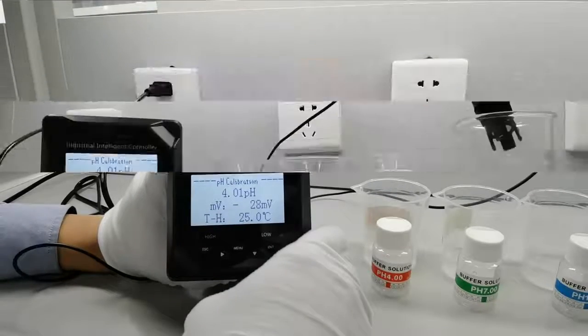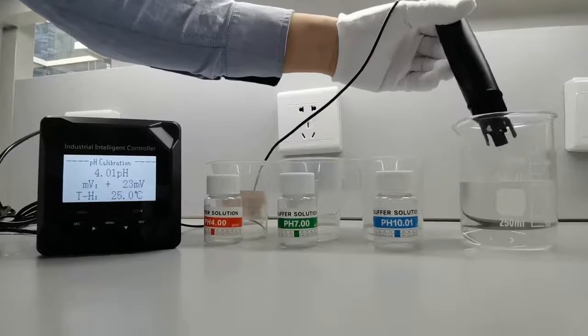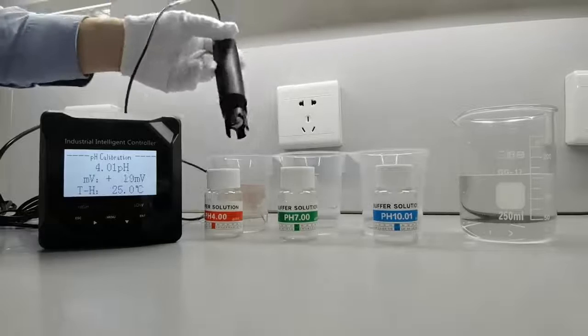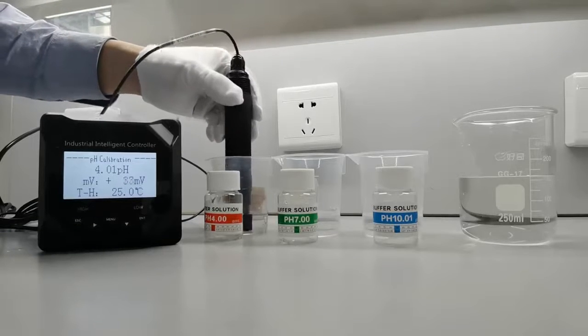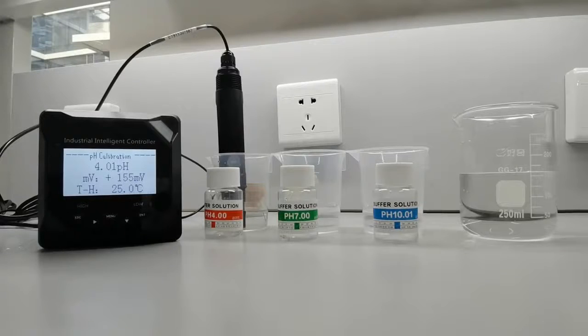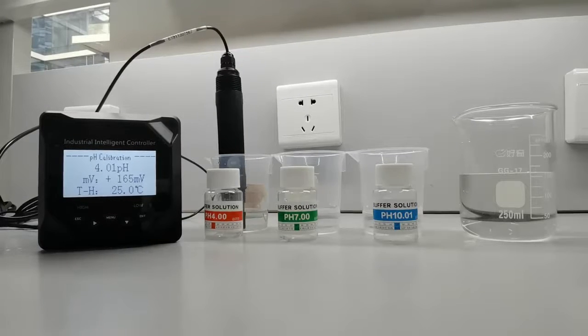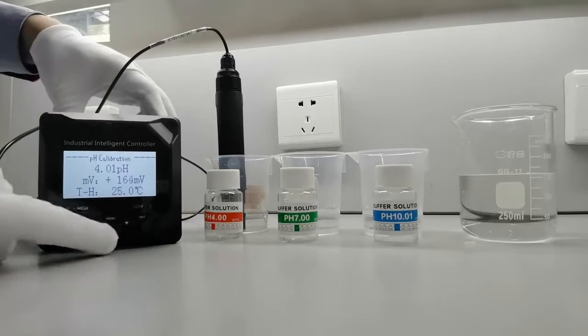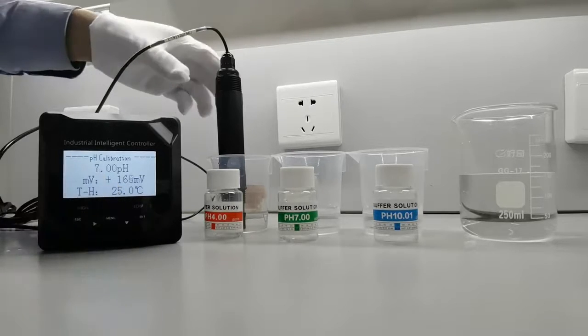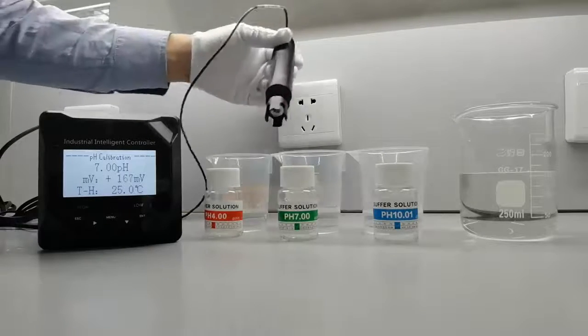To begin the calibration process, immerse the electrode in the pH 4 standard solution and wait until the measurement is stable. After the measurement is stable, press enter, then rinse the electrode in distilled water.